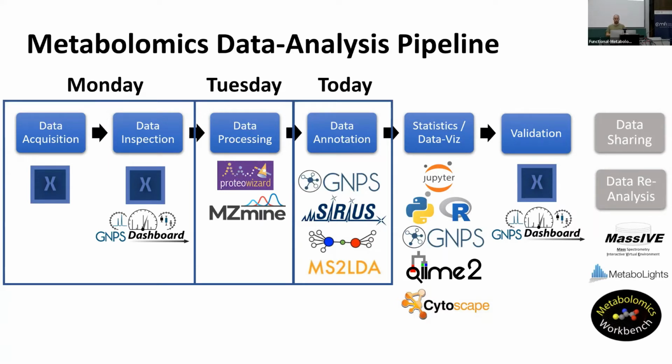And then later on, Kai will walk you through Sirius, which you will see has different tools for in silico annotation. And then after that, Madeleine and Justin van der Hooft will showcase MS2LDA. Afterwards, we might move a little bit into the visualization part, and I will show you how to merge these multiple layers of annotation within Cytoscape. But before we move on, I just want to reiterate the feature finding from yesterday.